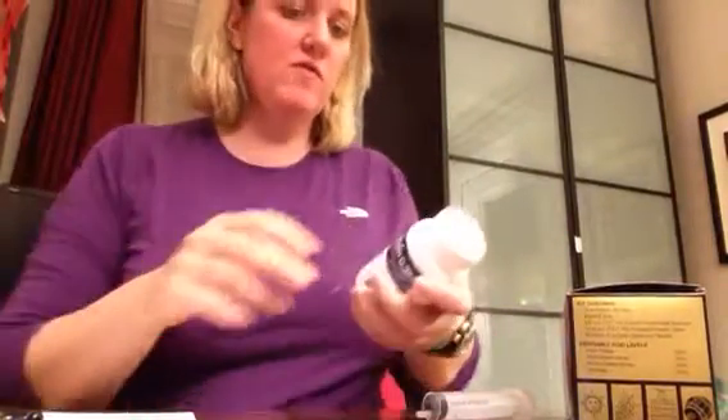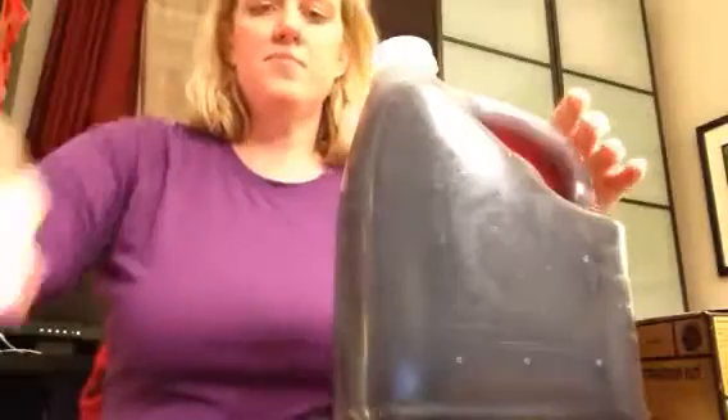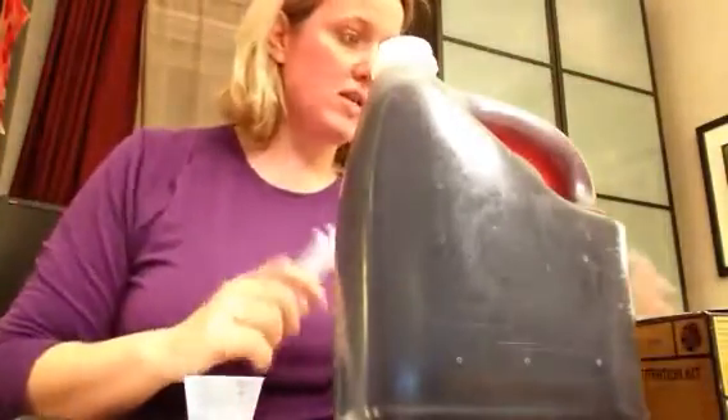Hi, it's Kirsten from Monroe Bay Wine, and right now we're going to do an acid testing kit. I have some wine that I made. I put it in this gallon jug when I was bottling, and by taste it was very acidic. So we're going to try and see if we can correct that.